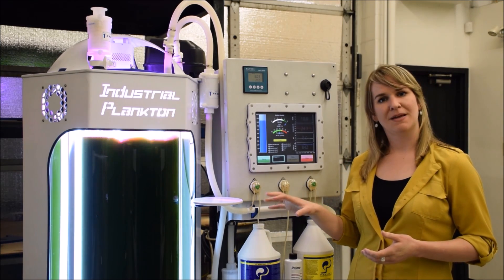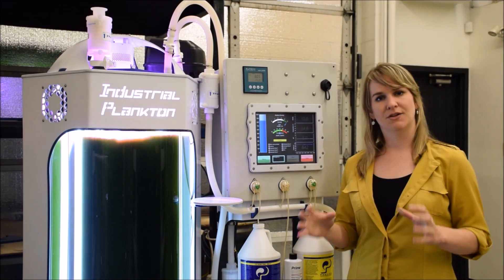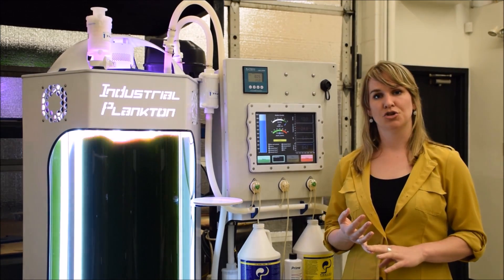We manufacture the PBR100L right here in our facility in Canada. This is a fully automated unit. It controls your temperature, pH, volume, as well as nutrients.